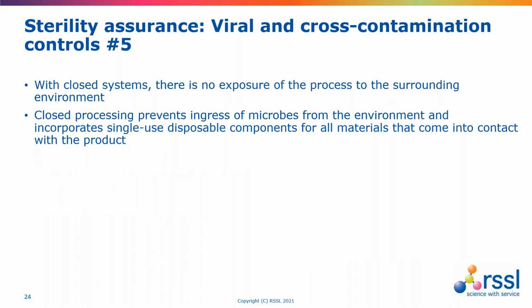Now, looking at the closed systems advantages a little bit further, in closed systems, theoretically there's no exposure of the process to the surrounding environment. Closed processing prevents the ingress of microorganisms from the environment, and it incorporates single-use disposable components for any material that comes into contact with the product, which can then be decontaminated and destroyed.